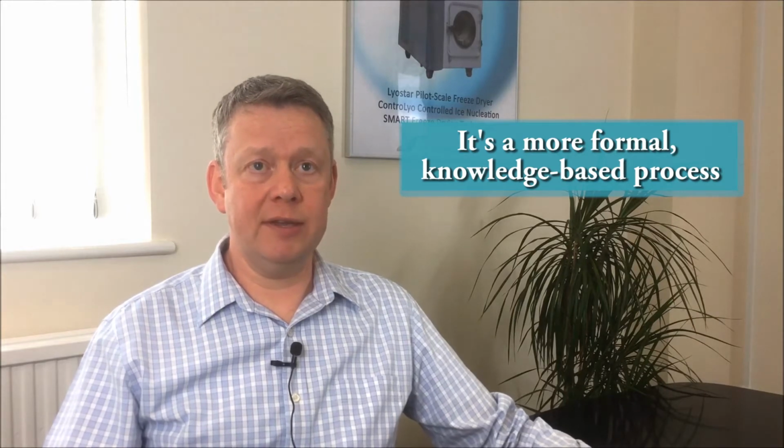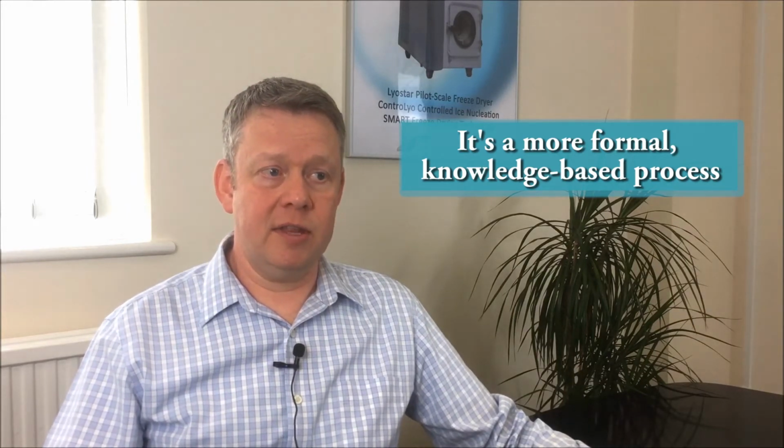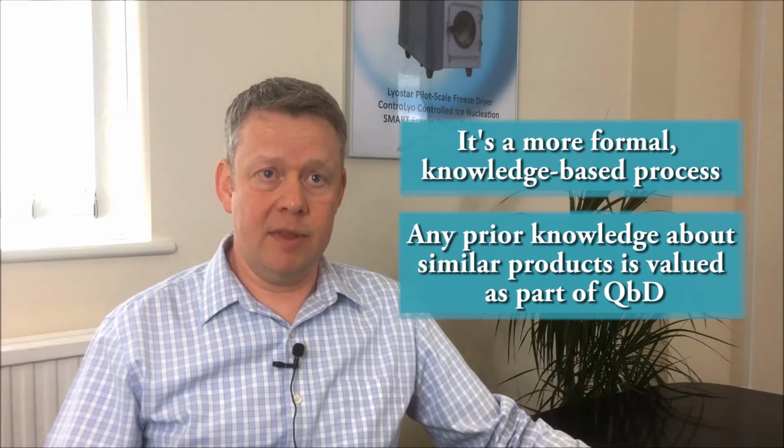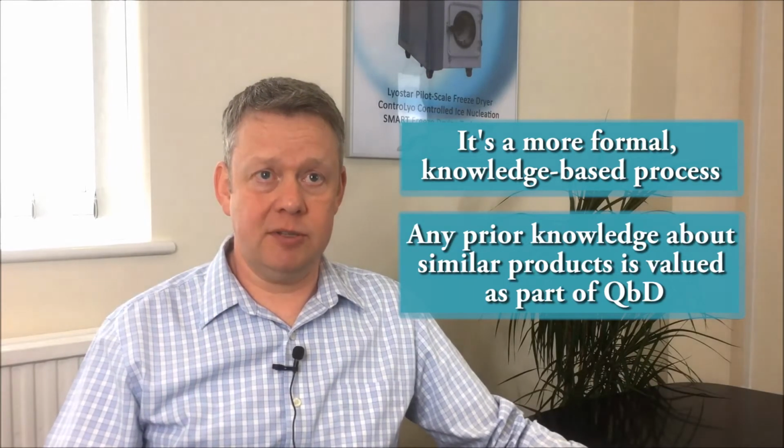Okay, so that involves some prior knowledge being put into the QbD process? Yeah, so it's a more formal knowledge-based process. So anything that you've learnt about similar products in the past, then that knowledge is actually valued as part of QbD. It's not trying to make us do everything by design of experiments, but it actually values our knowledge on where the risks are, where the difficulties are with processing similar products.